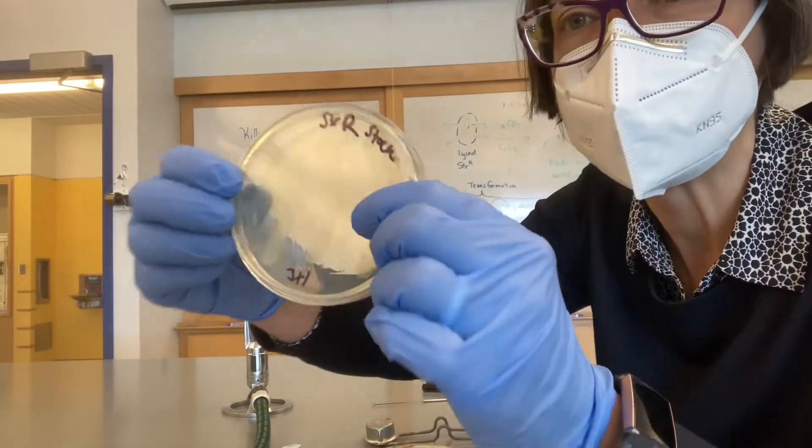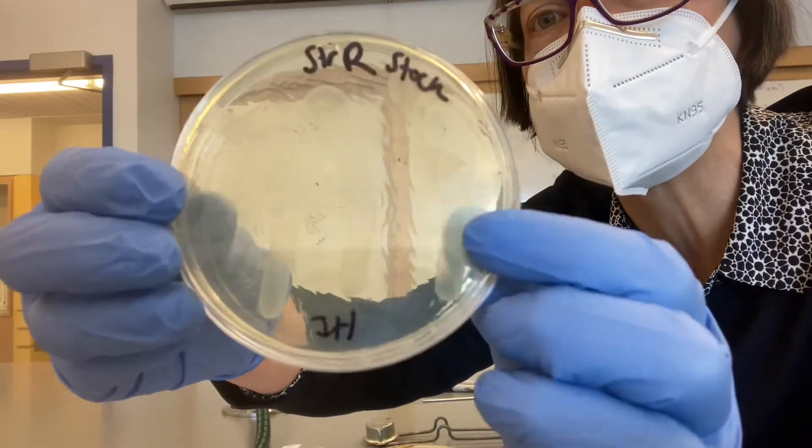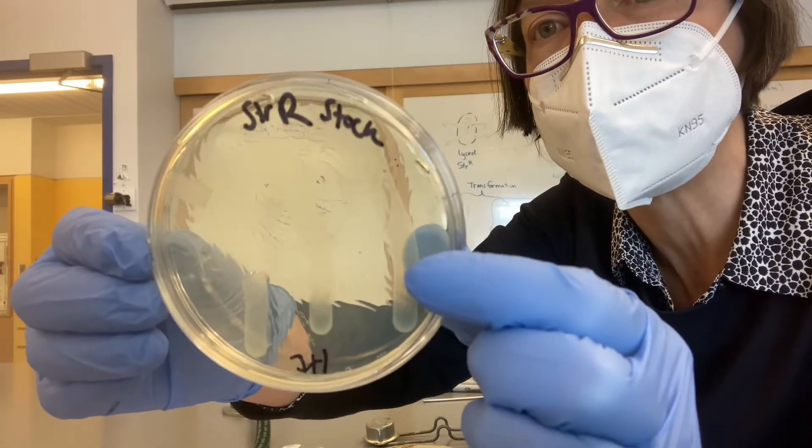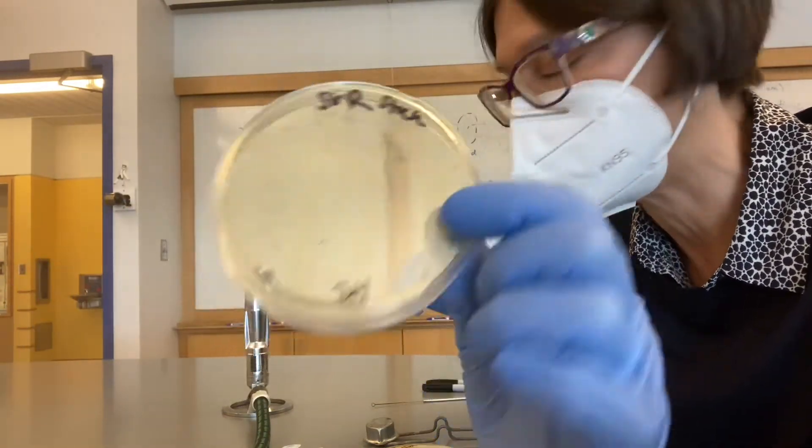And then we have a plate that also has cells growing on it. You can see the film through here. And it's the STRR strain, and it has the AAD2 gene.